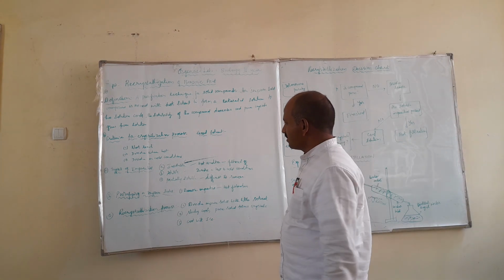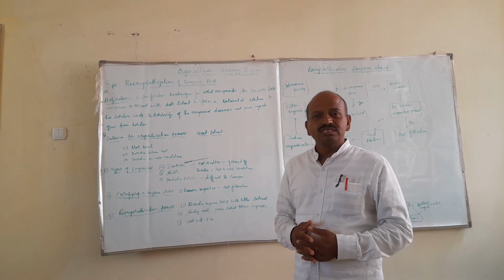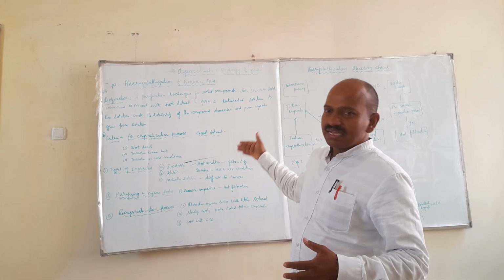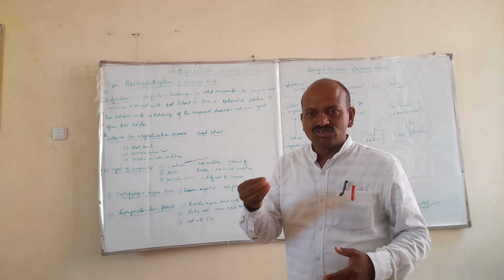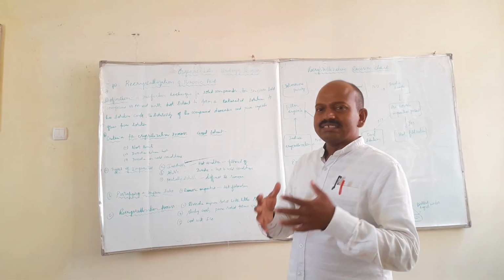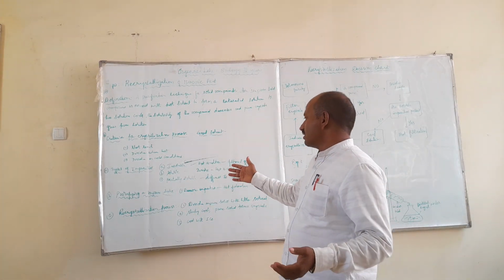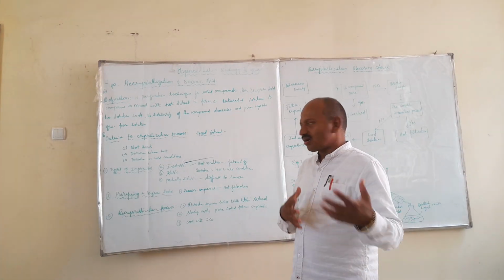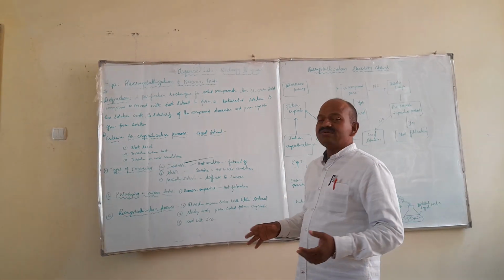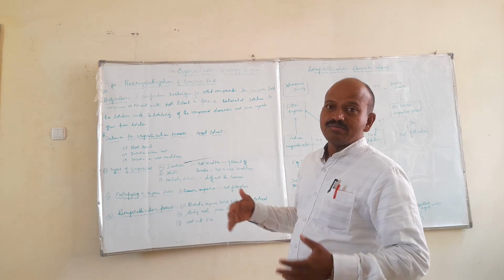There are some types of impurities: insoluble impurities, soluble impurities, and partially soluble impurities. Insoluble impurities will not dissolve even in hot conditions. If you mix some sand with benzoic acid as an insoluble impurity, and some sugar as a soluble impurity, the sugar dissolves. When we heat it, the sand does not react at hot condition, so it can simply be removed by filtration. The sugar is completely soluble at hot condition, so it dissolves. Partially soluble compounds are difficult to remove.